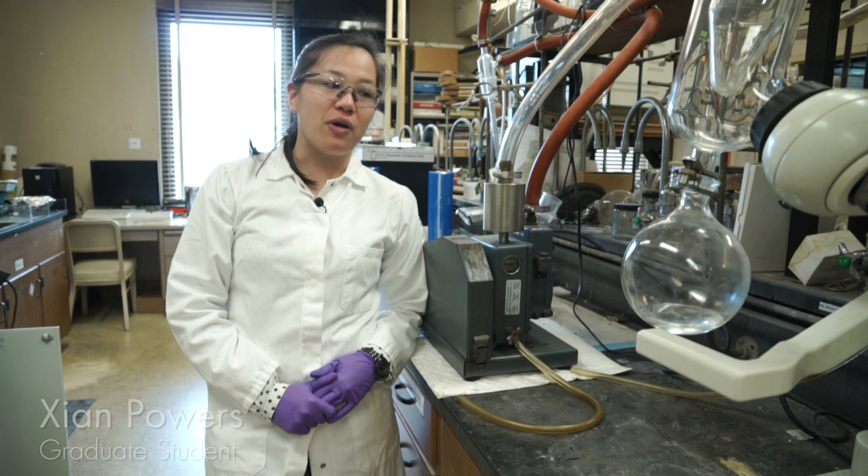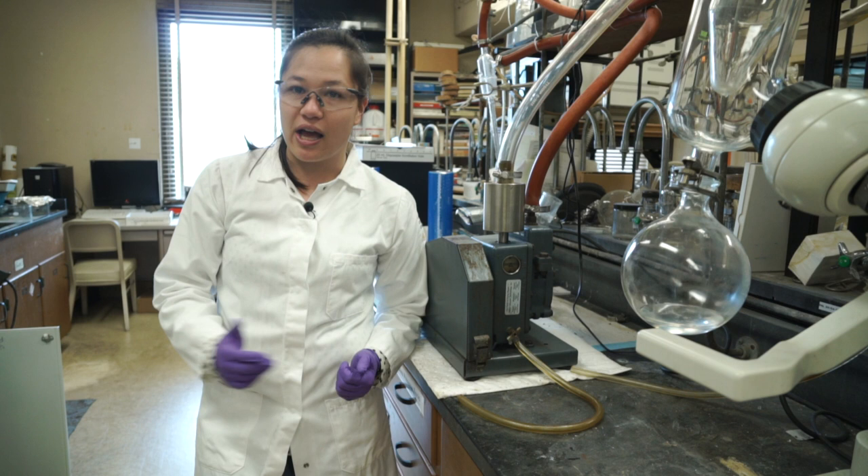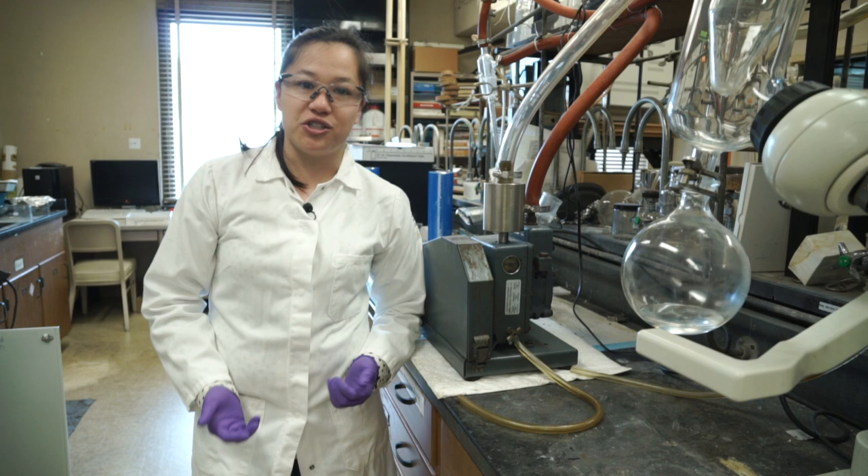Vacuum pumps are pretty useful for any synthetic lab where you may need to remove any solvent, and because of this, it is appropriate to keep it up to speed so that it performs as needed.